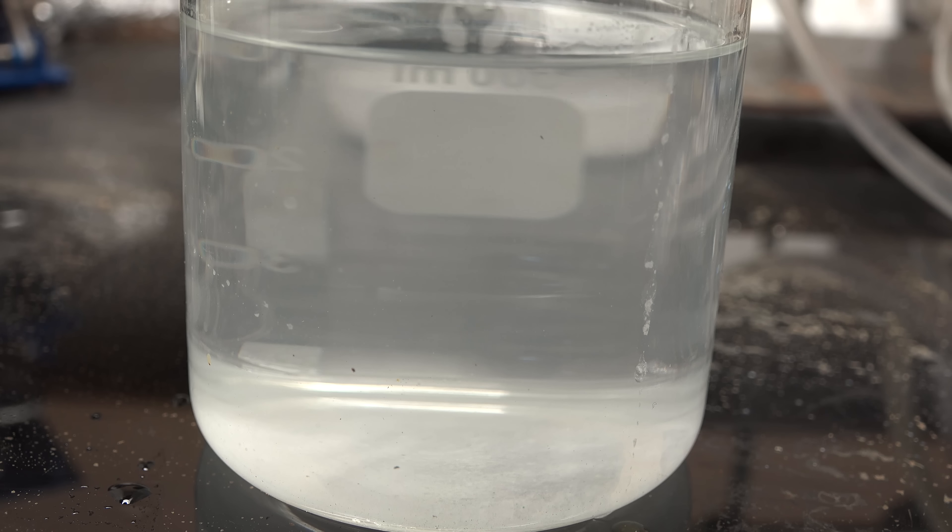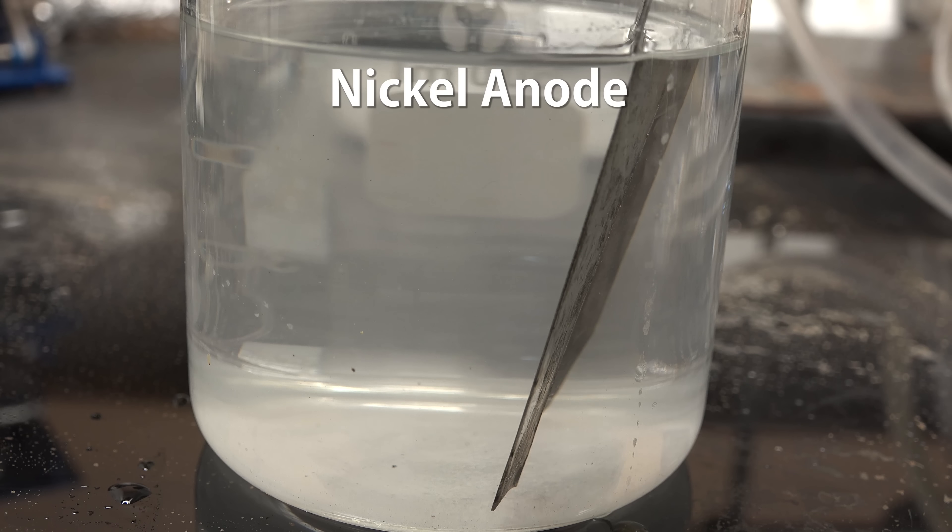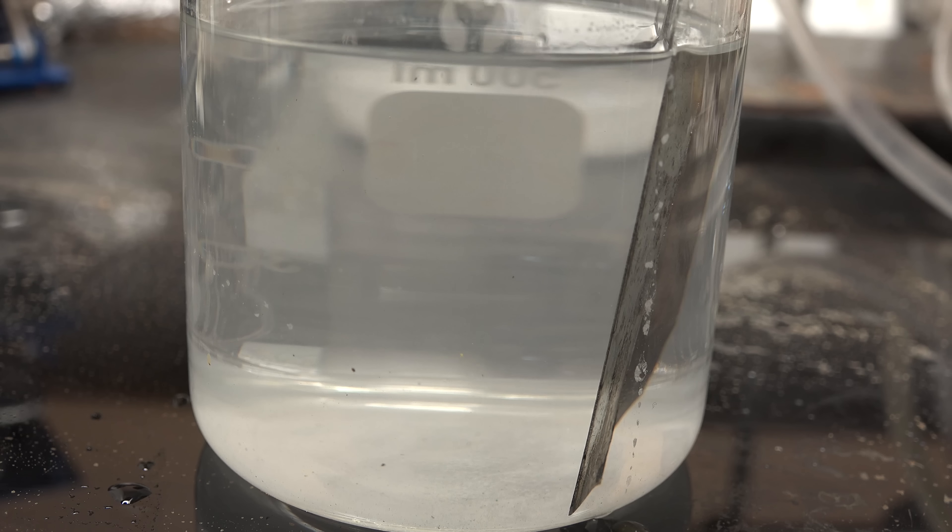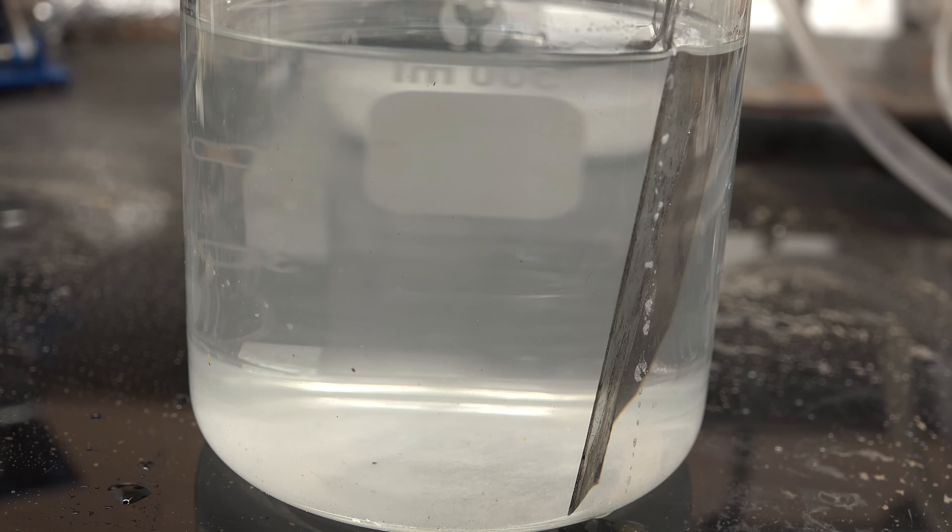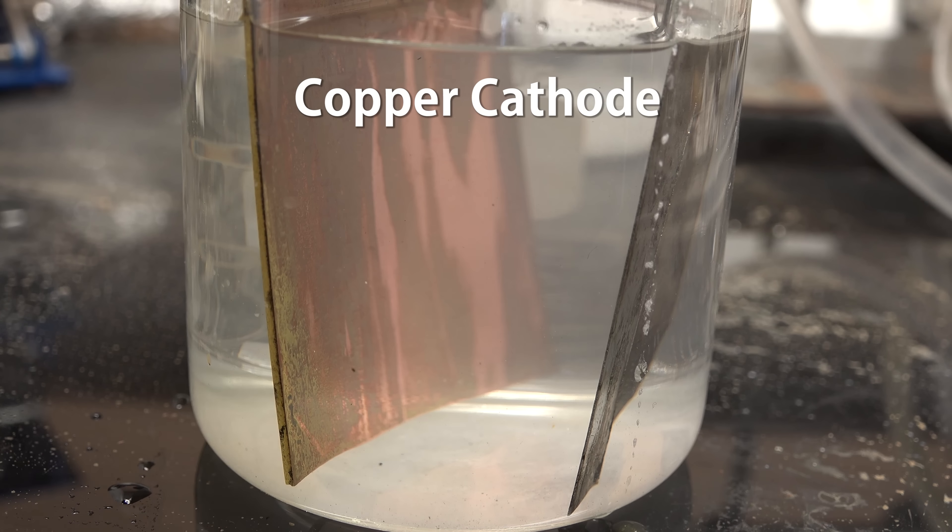Now we insert our electrodes. For the positive terminal or anode I'm going to use nickel strips. The great thing about this alkaline zincate process is that it's not as corrosive as acidic processes. Thus it can use cheaper and easier to obtain nickel electrodes rather than expensive platinum or toxic lead dioxide electrodes. For the negative terminal or cathode I'm going to use this copper circuit board. A zinc plate would be better but I didn't have one.